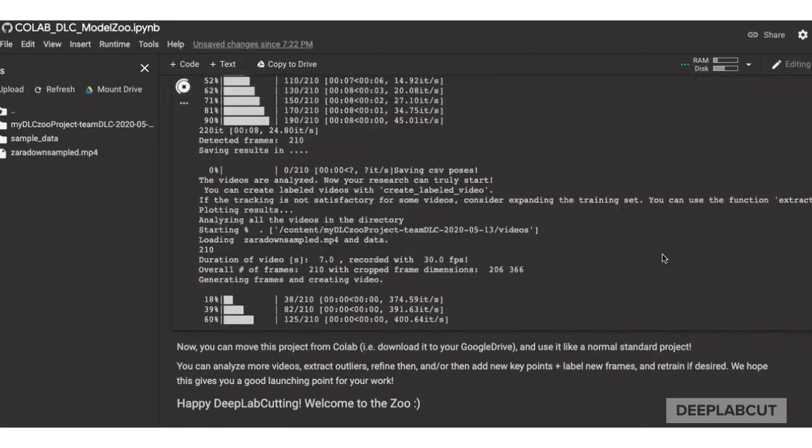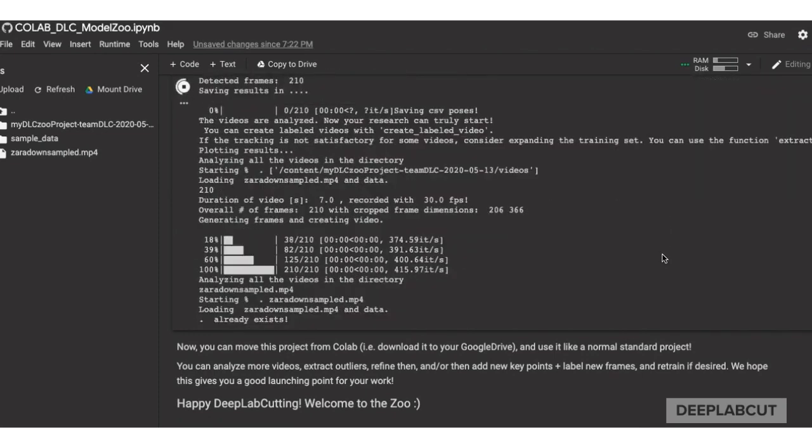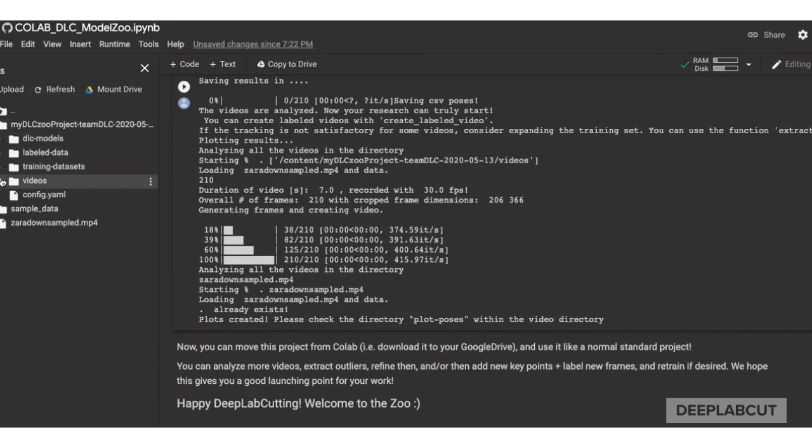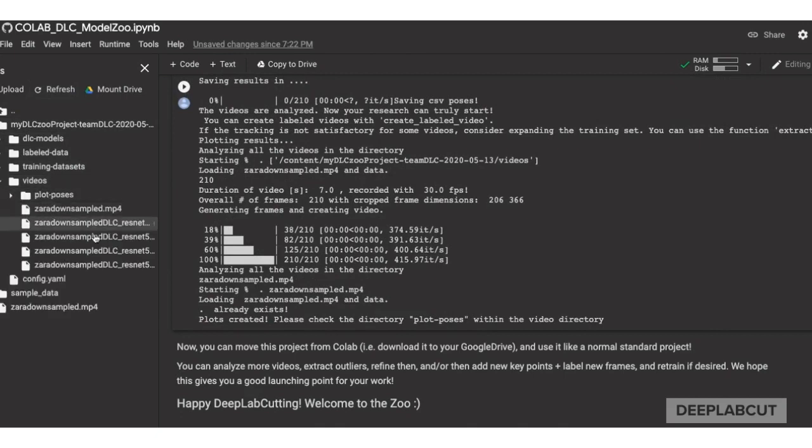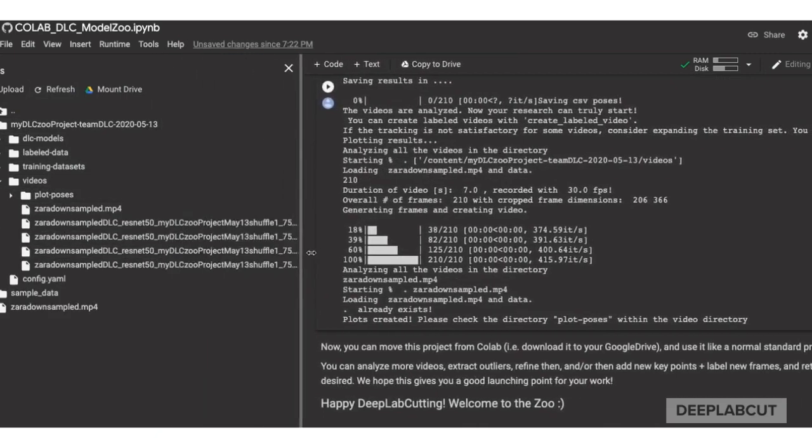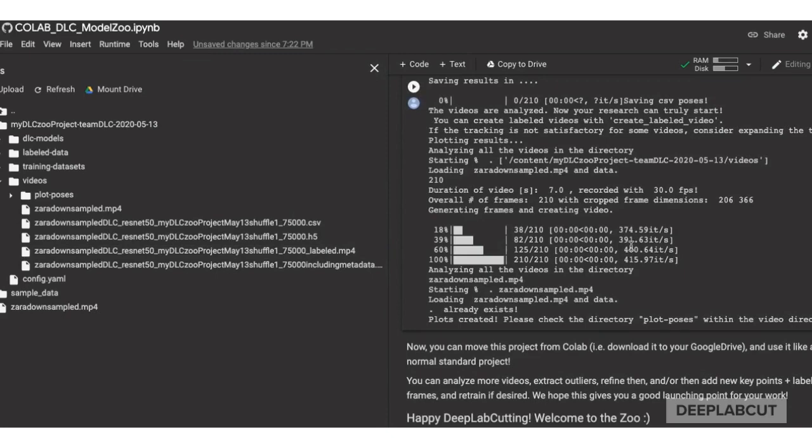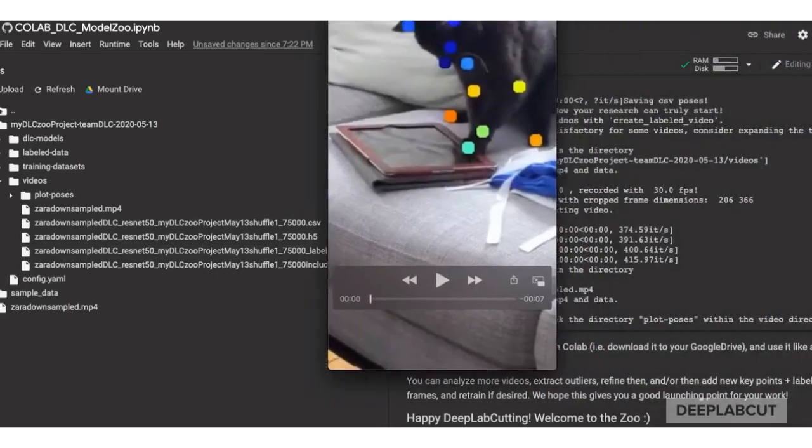You can go back to the file browser, navigate to this project, open it up. You'll see the videos folder now with the analyzed files, named H5 and a CSV file, and the label video, which we can download and quickly look at.